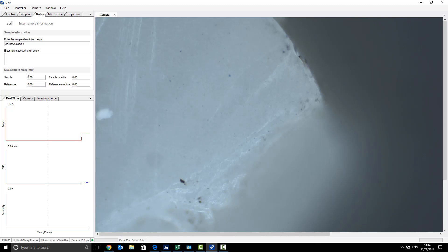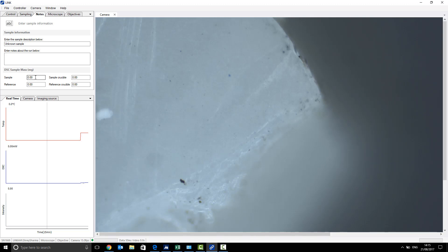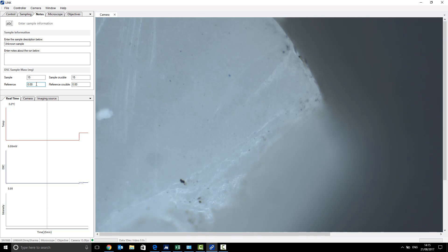It's imperative that you have the mass of your DSC sample and crucibles. This will help give the millijoules values and not just leave your DSC results in counts. So you want the mass of the sample, which we've weighed to be 15 milligrams, the mass of the sample crucible, which we've also weighed 15 milligrams, and the mass of the reference, this should be zero because your reference will be empty, and the mass of the reference crucible, which is also again, 15 milligrams.